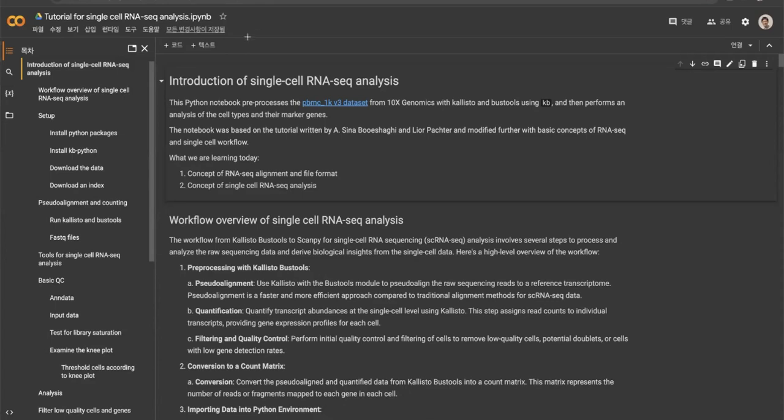So basically we're going to use Google Colab, which is a platform where everyone can publicly access the code or the research, with a bit of computing power as well. What you have to do is go to Google Colab in your web browser. You can use Google Chrome, Safari, or Microsoft Edge, and just type Google Colab. Then that will lead you to the website.